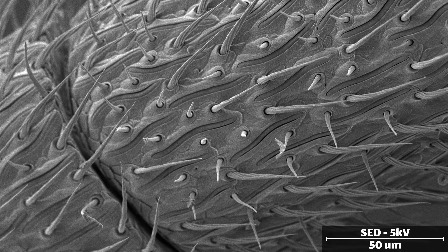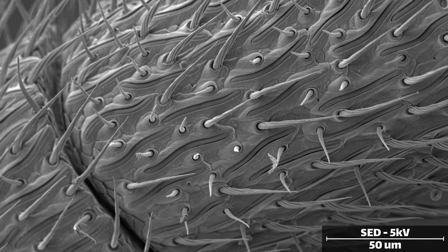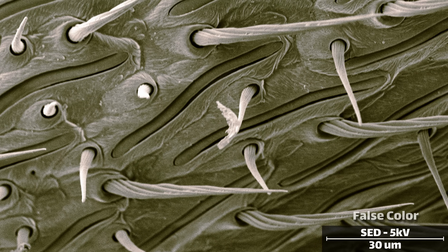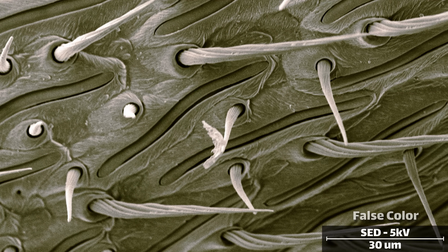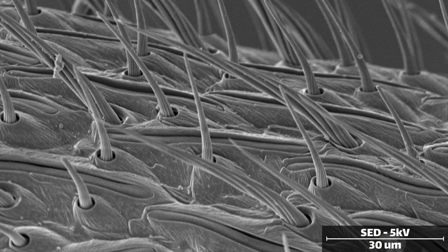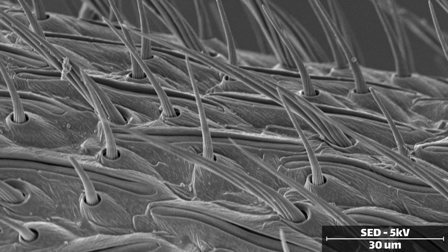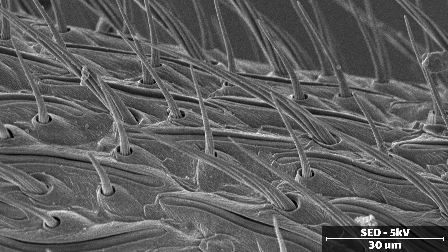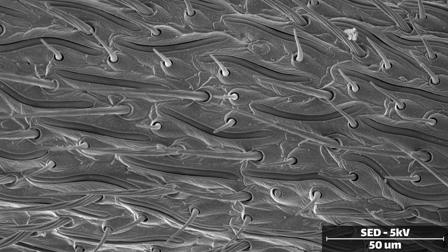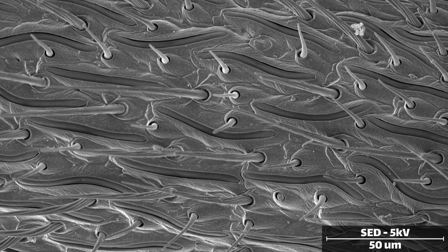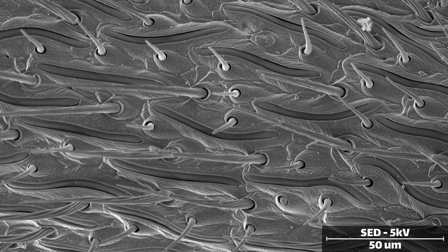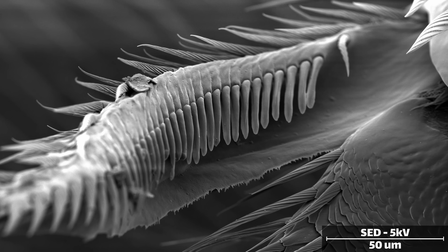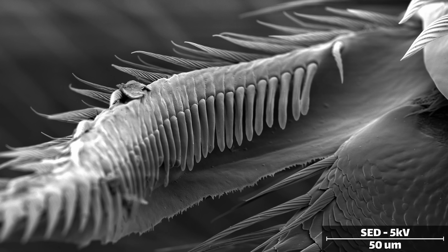Because an insect has two antennae, they can actually smell in stereo, which is an interesting thing to think about. When an odorant wafts by, an insect will smell it on each antenna at slightly different times, allowing it to know which direction that odor molecule comes from. There are also these long stripe-like pores in between the hairs. I couldn't determine exactly what they are for, but presumably they serve a sensory purpose as well, perhaps allowing chemicals inside the antennae or just giving flexibility to the antennae itself.